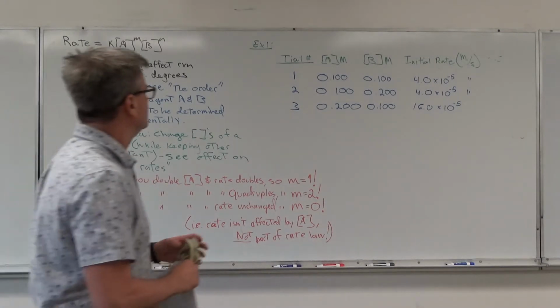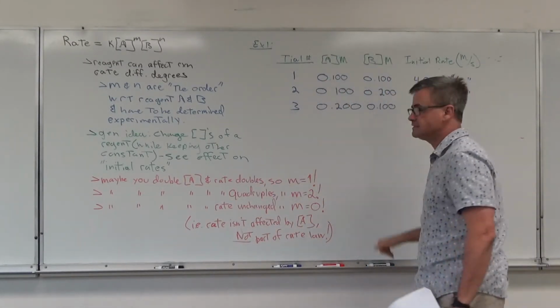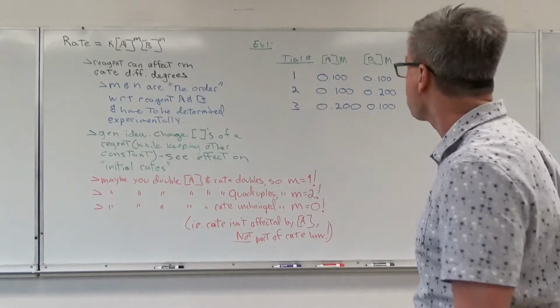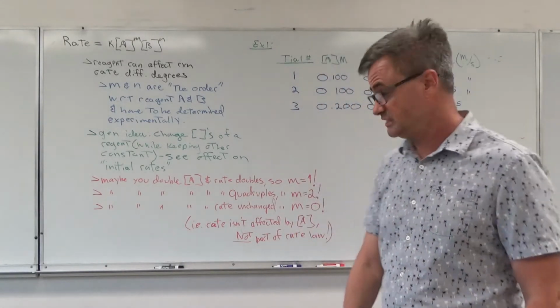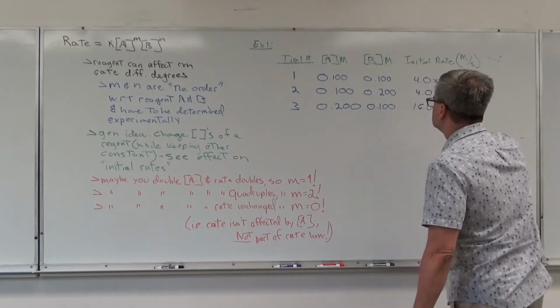Okay. Well, so if you look, what change do we make? This is sort of our initial state. In all of these, if you have 2 reagents, then you need at least 3 trials, just like we have here. And you're going to find that is the case for the experiment we do today. So we can look at this as sort of our initial state, trial 1.